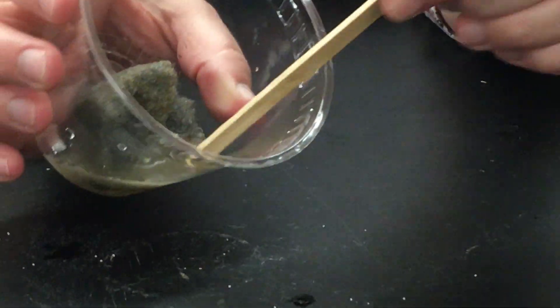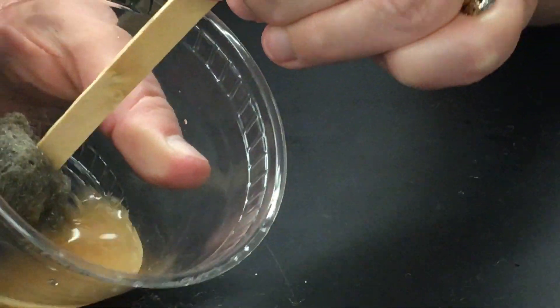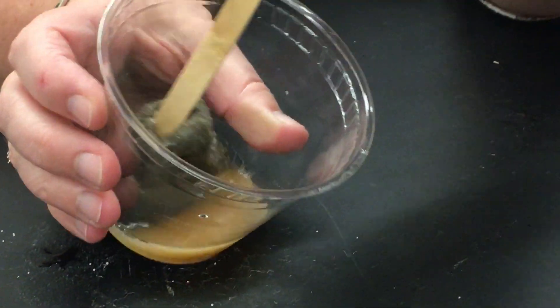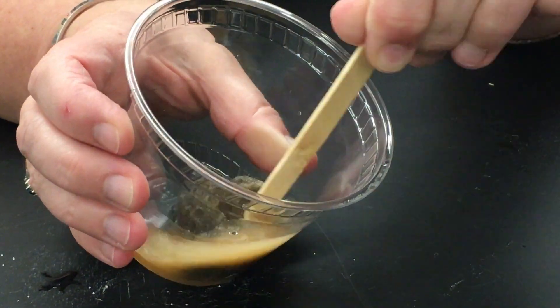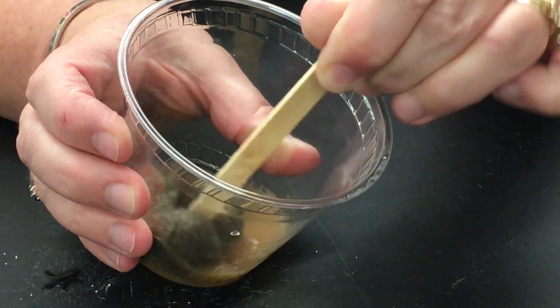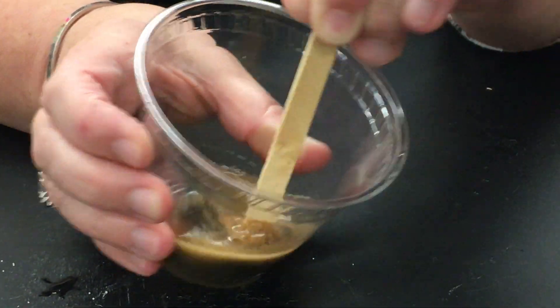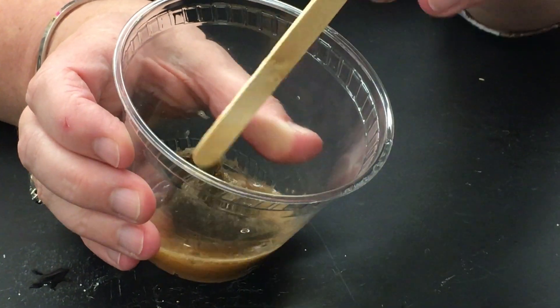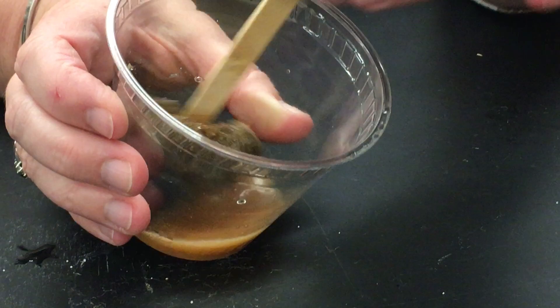The water is starting to get cloudy — kind of a yellow, see that? A yellow-orange. That orange is actually a formation of rust from the oxygen and the hydrogen peroxide mixing with the iron and the steel wool. Just like when your bicycle gets rusty. So we have a formation of rust.